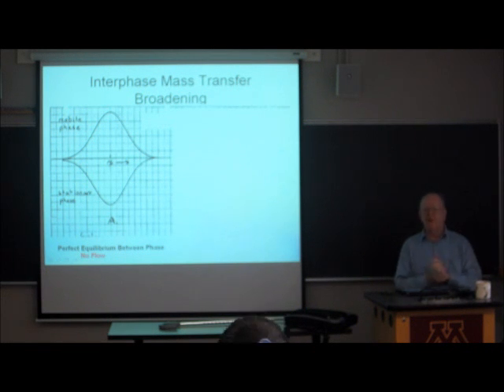Now, so far I haven't told you a darn thing about where A, B, and C come from, except they're somehow related to the particle size and the velocity and viscosity and diffusion and whatnot.